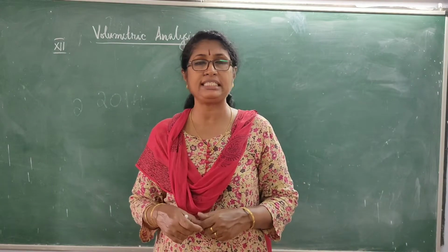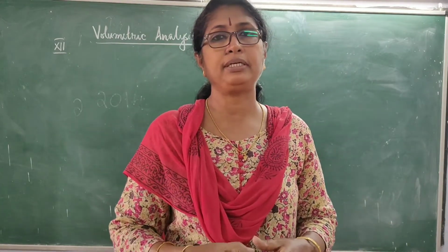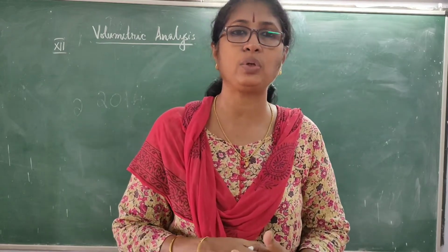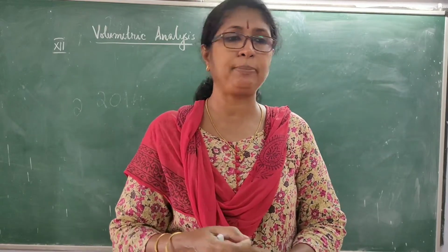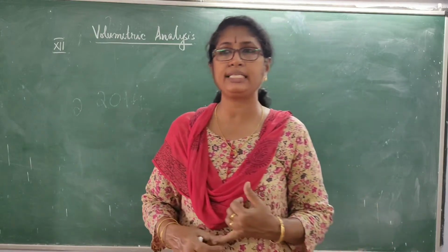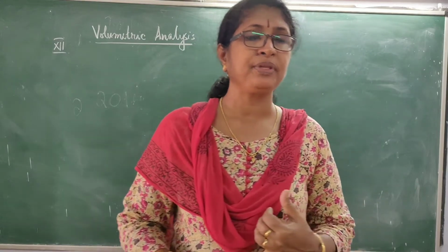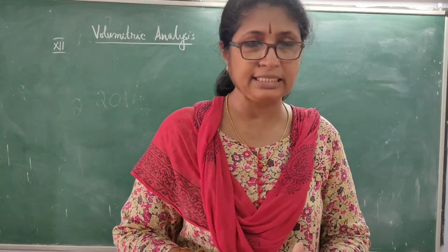It is quantitative analysis. For that, we titrate a known concentration of a solution against an unknown concentration and find out the concentration of an ion in a particular solution. So what we are going to do here is volumetric analysis, using the pipette and burette, the apparatus we are using, which I will explain later.